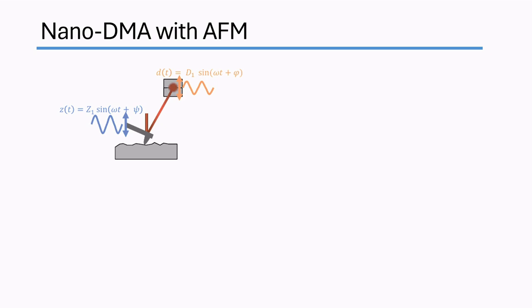And the cantilever is made to oscillate at a certain frequency and a certain amplitude on the surface of a sample. And there is an interaction going on between the atoms of the tip in the cantilever and the atoms of the surface. Depending upon these interactions, there is a change in amplitude and hence a change in the response of the cantilever.